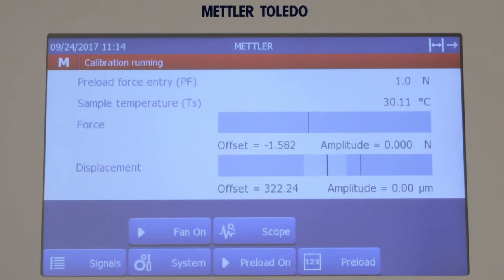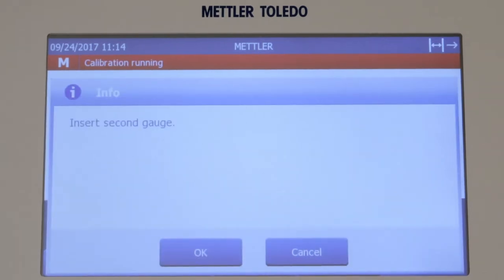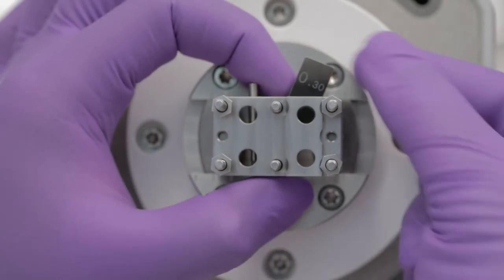The first adjustment parameter is calculated and stored. The message Insert Second Gauge appears. Carefully remove the gauge block.